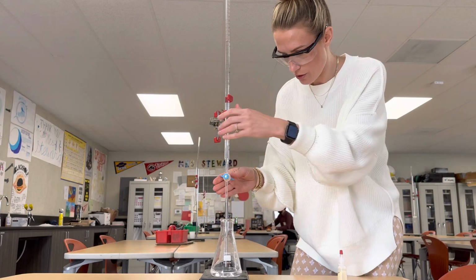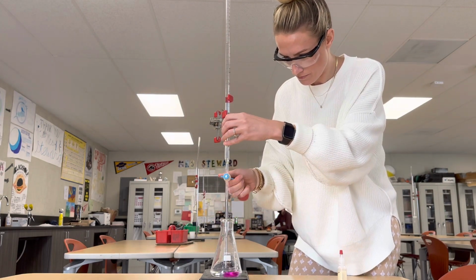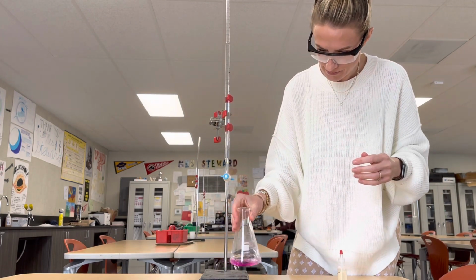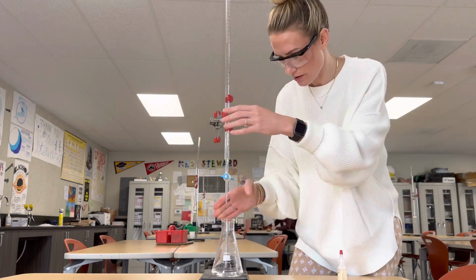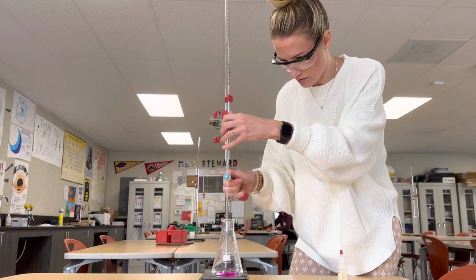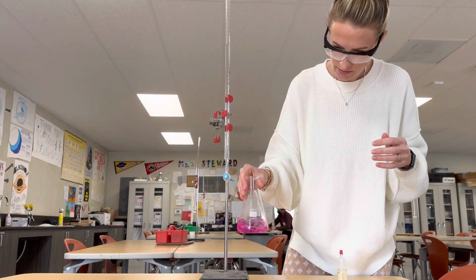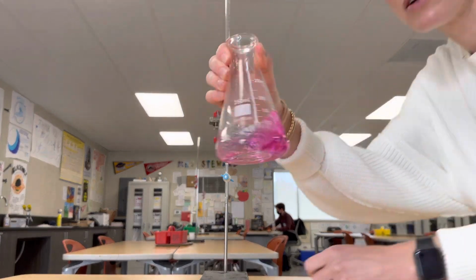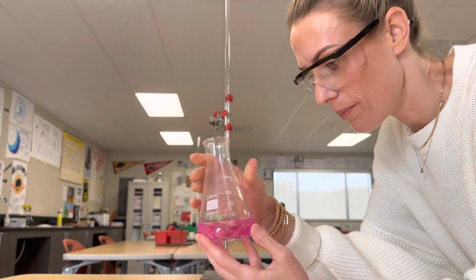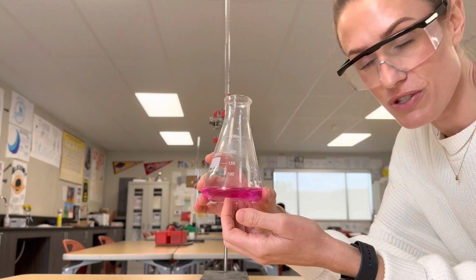All right, so we're almost there. Still changing, but it's definitely taking longer. All right, and now it doesn't look like it's going to change. So that might have been a little too far, but I now have a neutral solution.